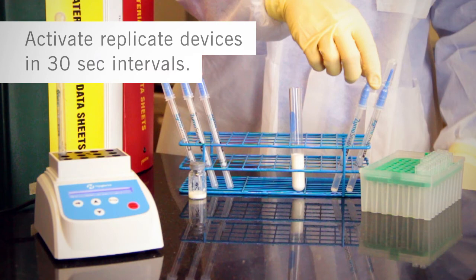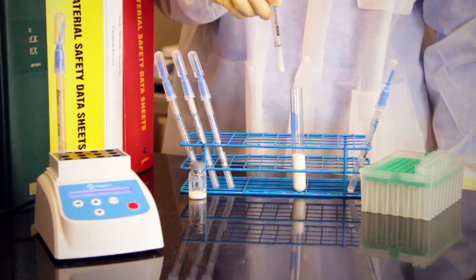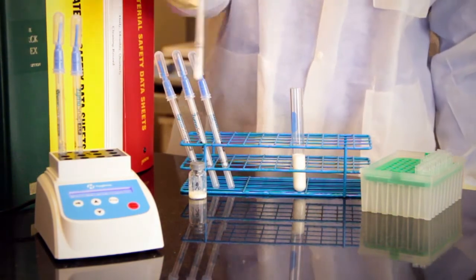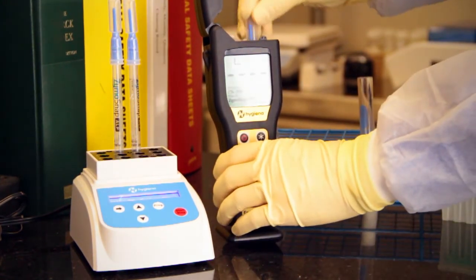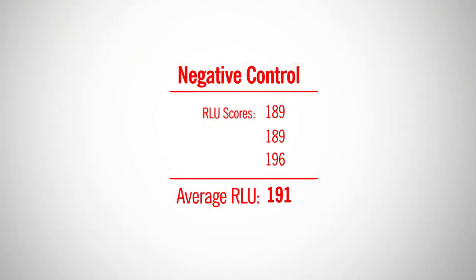Be sure to activate each test device in 30-second intervals so that the light reaction is at its peak immediately after incubation. During incubation time, turn on the luminometer. After the incubation time is complete, immediately place the entire device into the Ensure luminometer and press OK to initiate measurement. Be sure to measure each negative control replicate in 30-second intervals. Record the RLU results. Average the 3 results — that number is the background RLU level, also referred to as the negative factor.